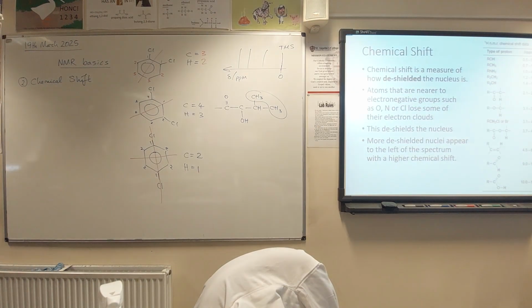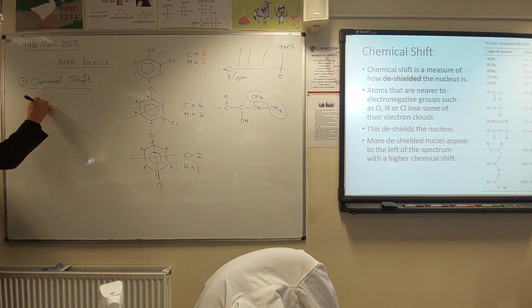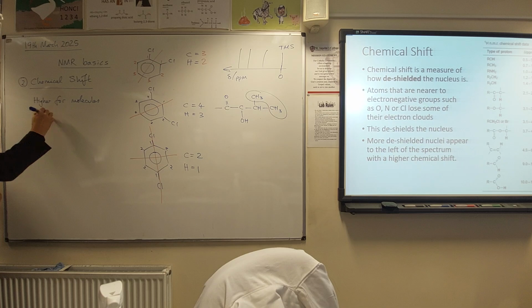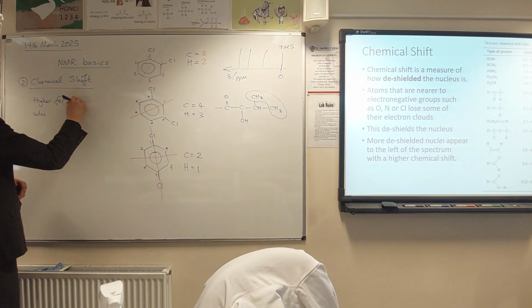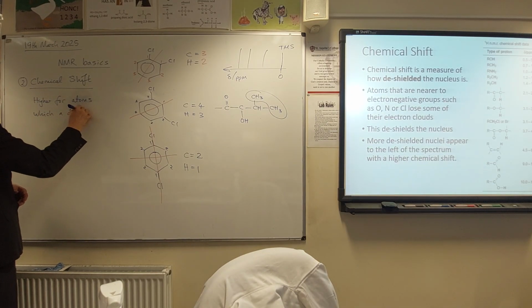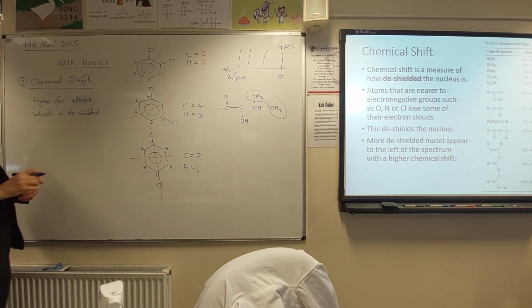So broadly speaking, the chemical shifts are higher for atoms which are de-shielded. I can't spell. De-shielded.